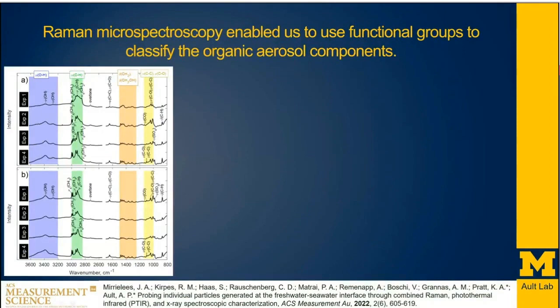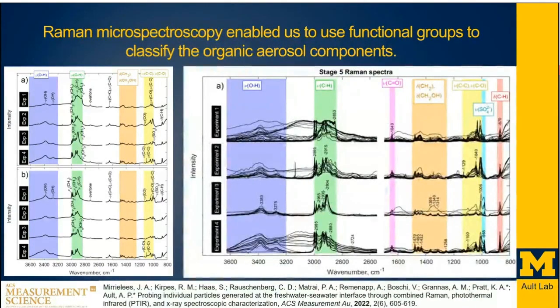And these on the left here are all averages of quite a number of spectra, but I wanted to show you on the right here some of the different individual spectra for the particles that are in the upper left here. And one of the things I wanted to make a point of is that you actually get quite a bit of good reproducibility. There's the occasional outlier, but a lot of these peaks are very reproducible.